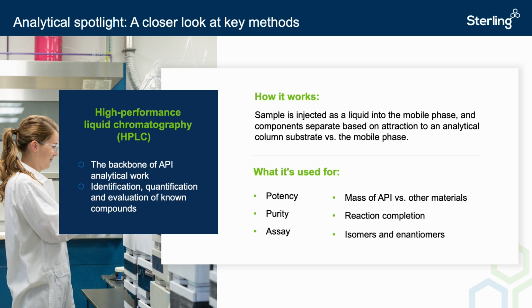Evaporative light scattering detectors, or ELSD, are useful for compounds with poor UV response or those that lack a chromophore. These work by nebulizing a sample solution across a light source. The scattering of the light or disruption from the compound is measured and compared to the non-scattered light to calculate the compound response. Charged aerosol detection, or CAD, is similar to ELSD, but an electrical charge is applied to ionize the analyte. The resulting change in energy is then collected by a detector.